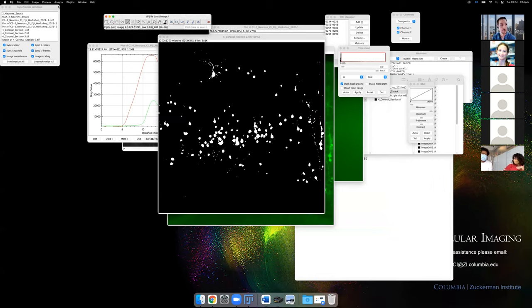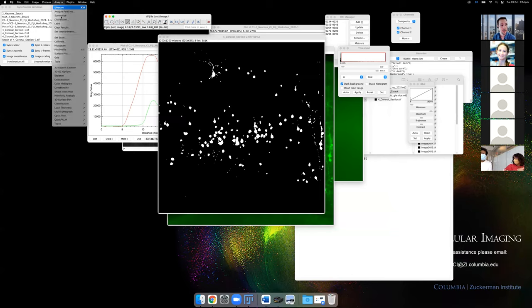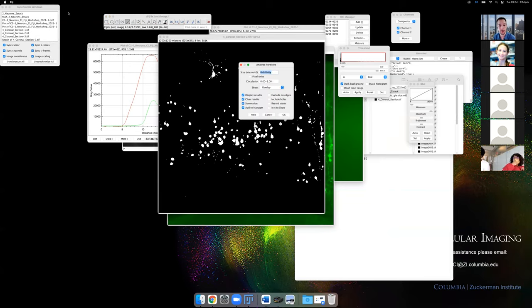Once you have thresholded data, go to Analyze > Analyze Particles. This counts the cells or blobs in the image — similar to what many people use Imaris for. You can set size parameters to filter out noise, for example specifying that objects should be smaller than a maximum size and setting an upper limit. Next week I'll also show how to do this in 3D quickly.